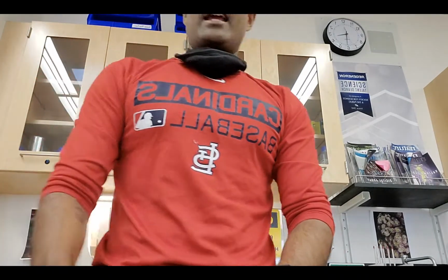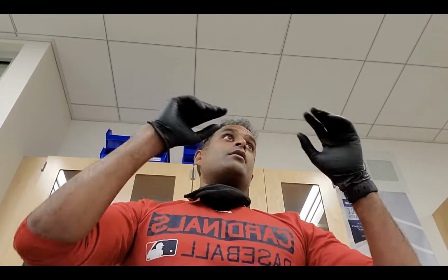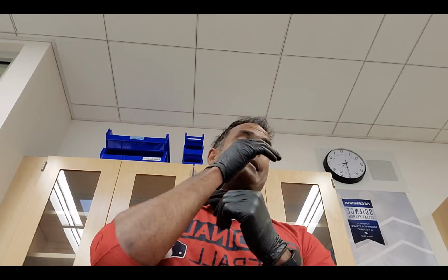Okay, so the first thing I'm going to do is say, hey, Paul, what kind of personal protective equipment do I need? I can't just assume that I need gloves. I'm going to have to ask because I never know as a new person what's dangerous and what's not. So, Paul, what kind of personal protective equipment do I need? You need gloves, Luke. Okay, thanks, Paul. All right, so I've got my gloves on.